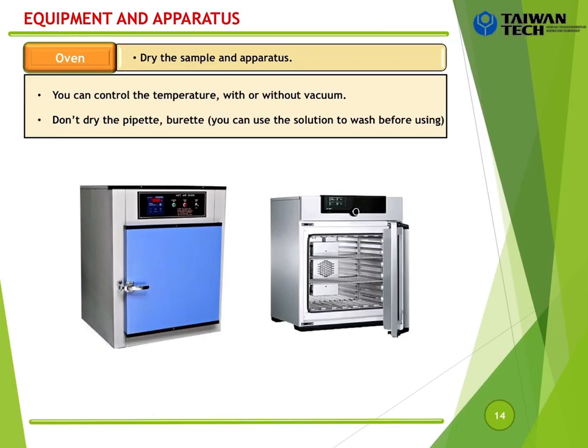And you already know about something to use to measure the volume, okay? And when we use some equipment, after using, you also need to wash it, right? And after you wash it, maybe you have some water, okay? And with this water, how to remove the water?